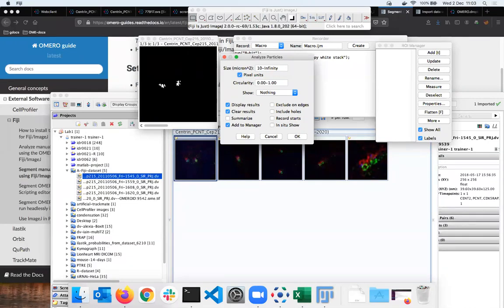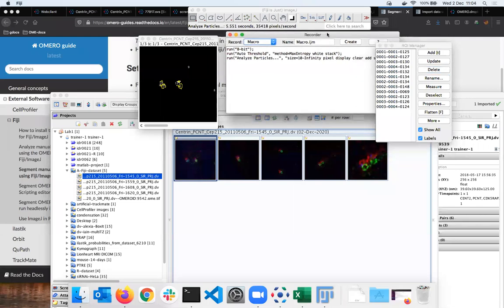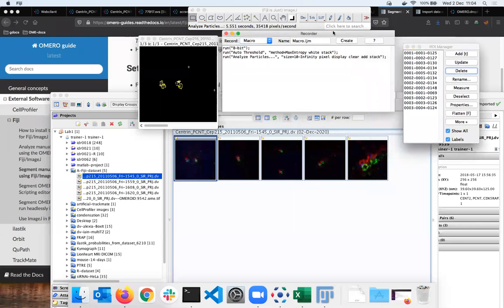By the way, of course, this is a result of a painstaking work on this workflow. As you might imagine, with every image analysis, you want to do something like that, because you have to tailor your workflow according to the images you are working with. And then say, okay, process all 3 images. You say yes, save one measurement which was lingering there in my table. I don't want to save that. There is another very important line added to my macro recorder.